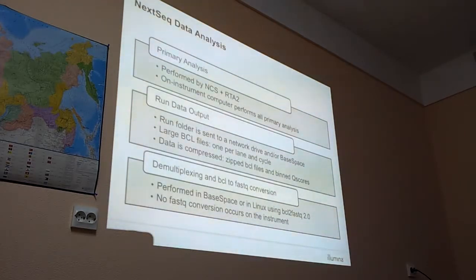So BaseSpace on-site now has the software to do whole genome sequencing, exome sequencing and RNA-seq. So there you already have the software. For other applications, at the moment, with BaseSpace on-site you get the FastQ files, the standard format that you can import in other software packages. But then you still need another software.